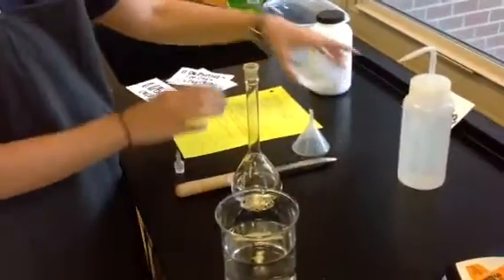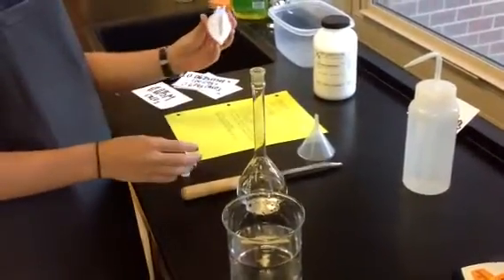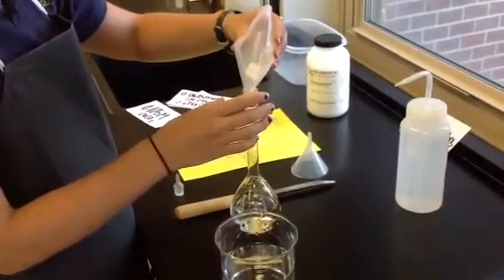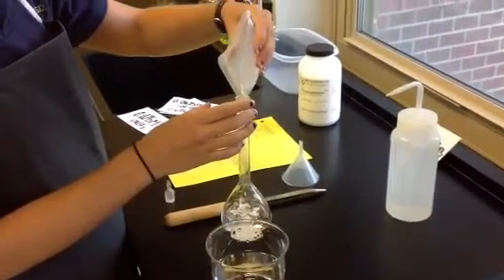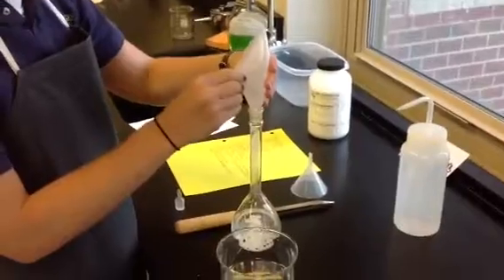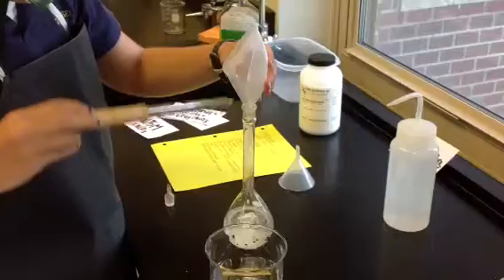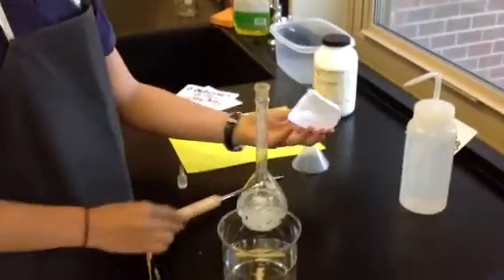After I get my accurate measurement, which is in this weigh boat, I fold the weigh boat in half and use it almost like a funnel, and I put it into my distilled water. Use your spatula for some help there.